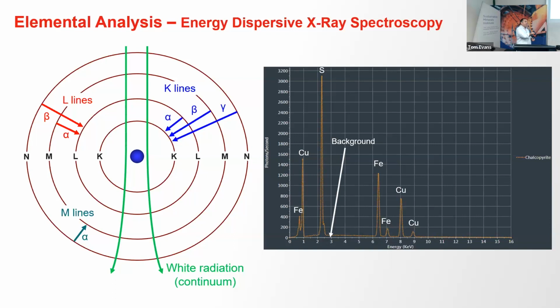If you look at the previous image, we want to capture hundreds of thousands, millions, or billions of acquisition points. And each of those points is basically a spectrum. It's a spectrum for each acquisition point. So if you want to work with a spectrum like this, you would be acquiring for months, which is not practical in reality when you want to cover very large areas.